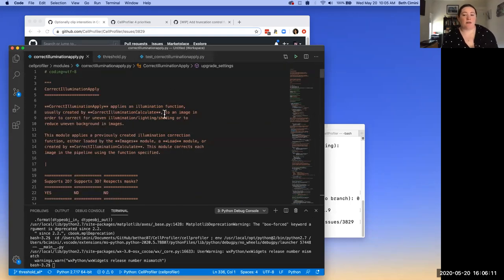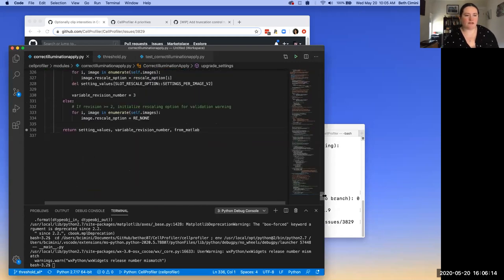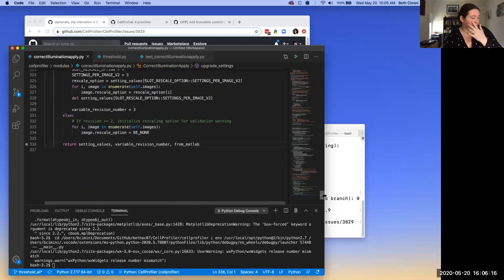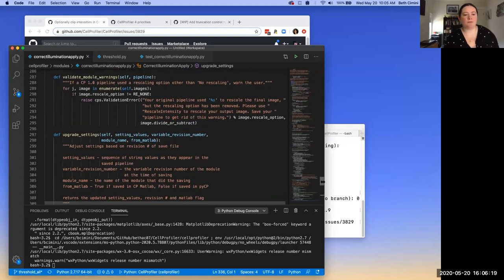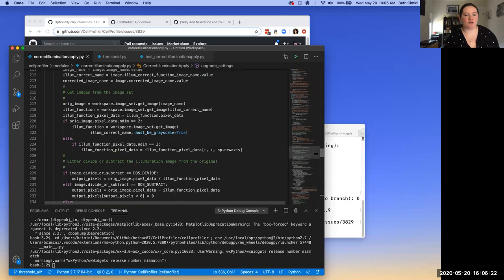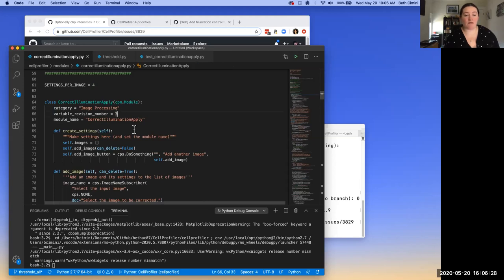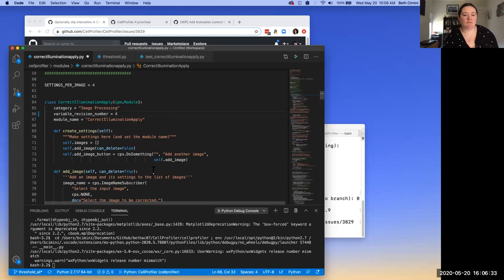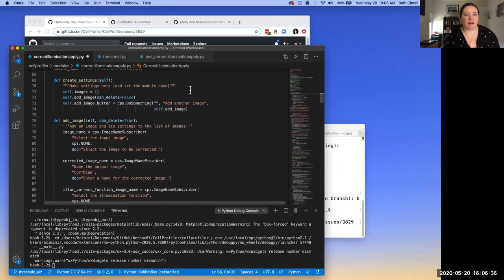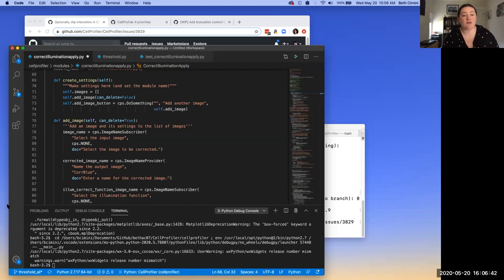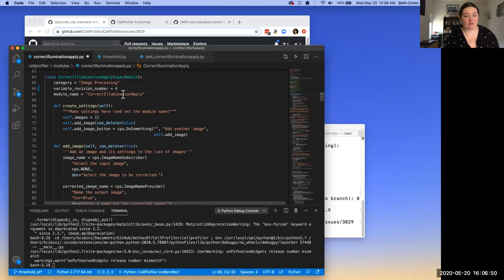Here's the correct_illumination_apply module — it's only a little over 300 lines of code, not one of the longest in CellProfiler but not the shortest either. The first thing is we're making a new version of this, so I'll increase the variable revision number. Going back to our ideas about which of the four parts of CellProfiler we're changing — we want to implement two new settings, so that means we need to add two settings in the create_settings functionality.